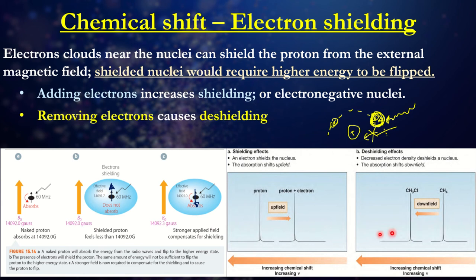If you have a look at the charts that we have here, the absorption shifts go upfield, so the shifting that we see will obviously in that sense go down. And then if it's a de-shielding effect, the absorption shifts go downfield, so like so. So it can actually tell us the way the electrons are behaving in the molecular structure.